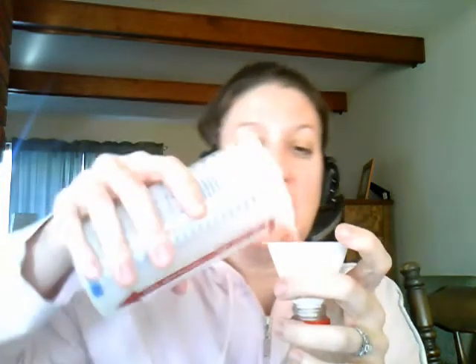You're also going to need some yeast. Now, yeast has to be kept in the fridge so that it remains inactive. Once it gets nice and warm, it's going to start fermenting. Okay, so first thing we're going to do is take some of this lukewarm water, because I can't pour, and I don't want to spill it all over my table. We're going to pour some of this lukewarm water into our bottle.